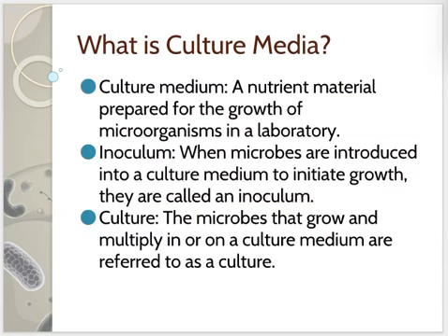Now, what exactly is culture media? It's basically a nutrient-rich material prepared to help microorganisms grow in the lab. When we introduce microbes into this medium, they become what we call an inoculum. As these microbes grow and multiply in or on the medium, we refer to the resulting population as a culture. These definitions are key to grasping how microbiologists work with microbes in controlled environments.